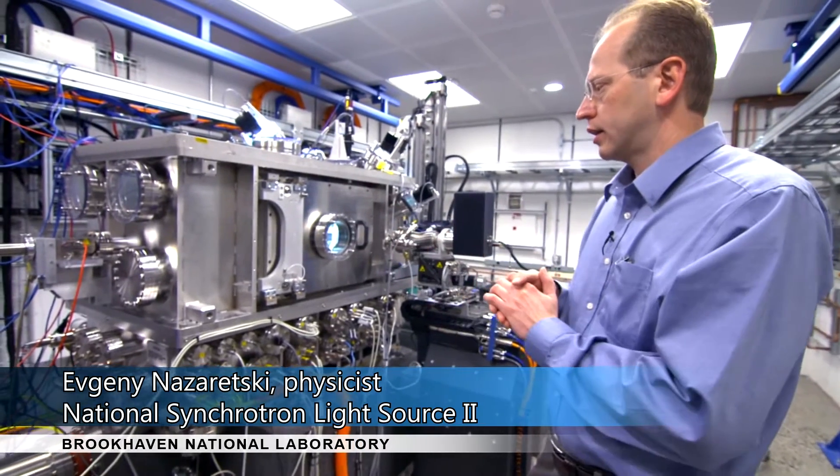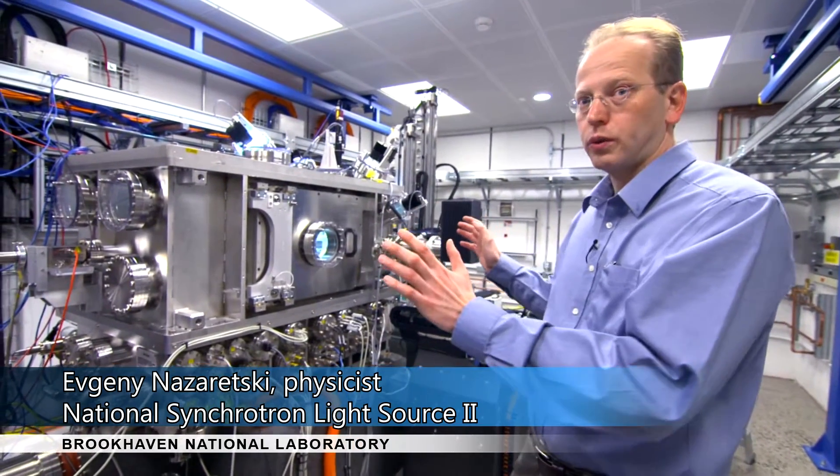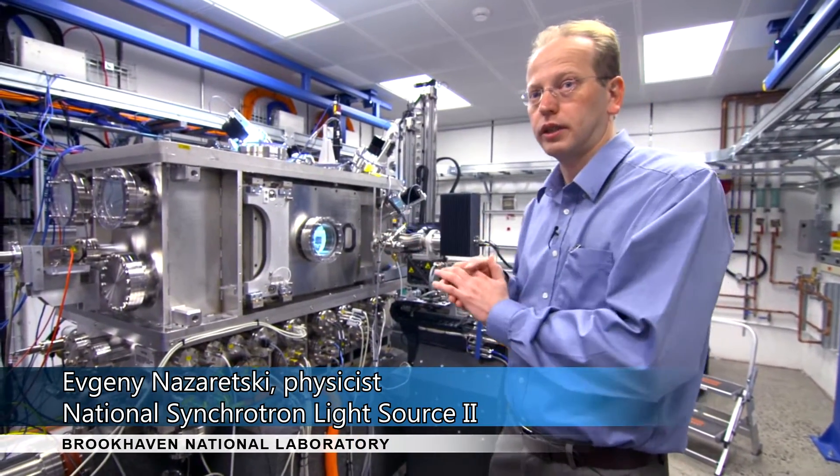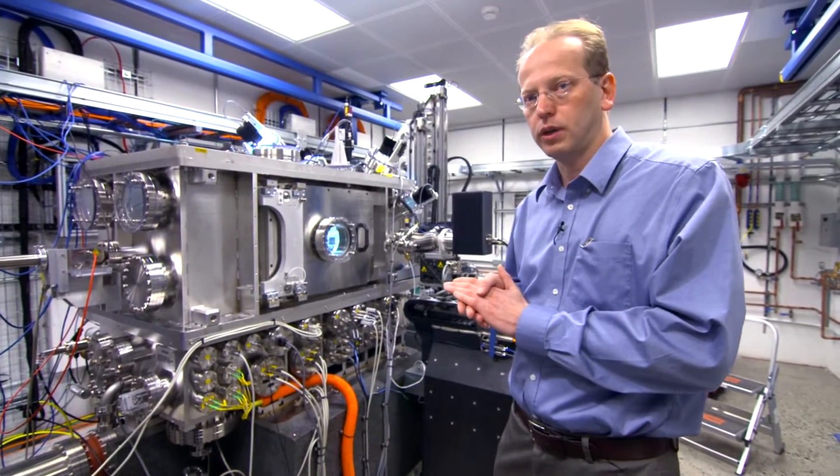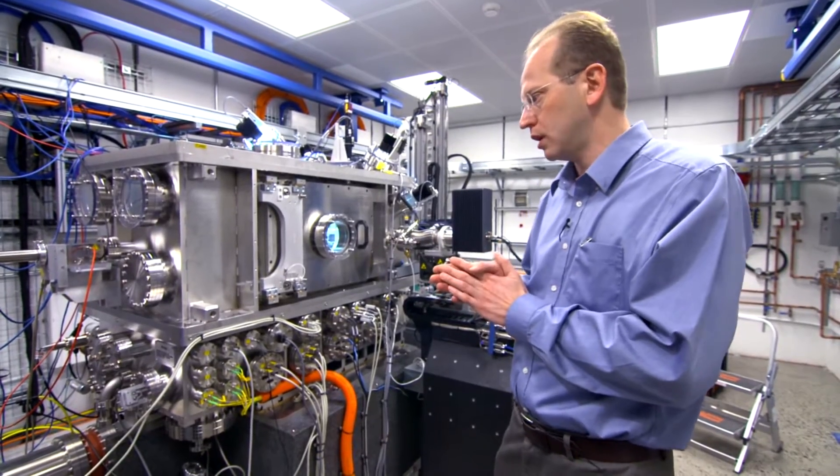We're looking here at the MLL multi-layer Laue lens microscope, which was designed and constructed here at NSLS II, which is part of the hard X-ray nanoprobe beamline, the nanoimaging beamline.